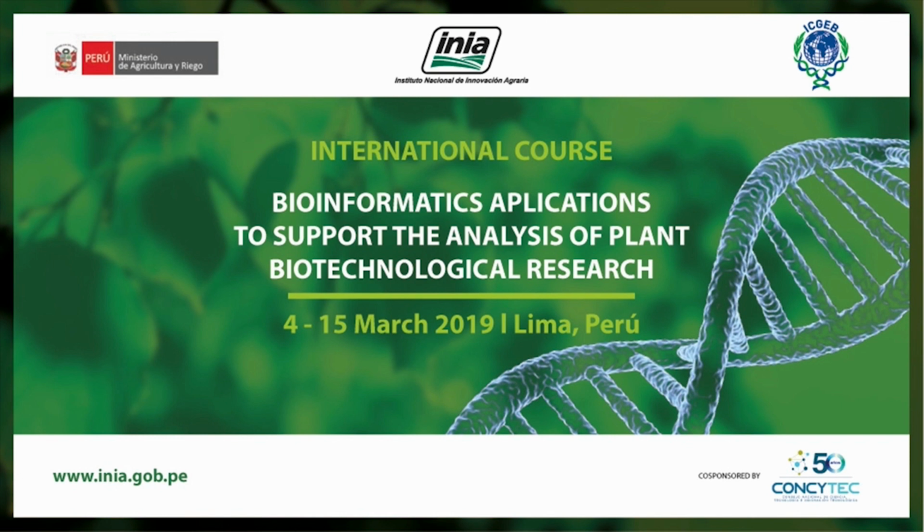My minus outfmt should be Clustal. There we go. Outfmt Clustal.